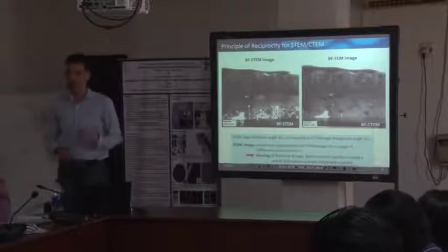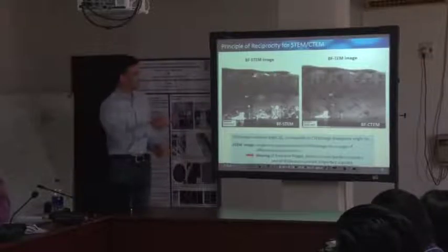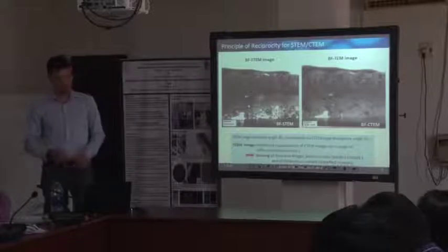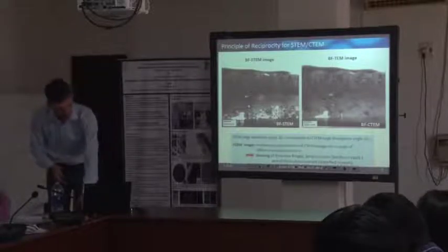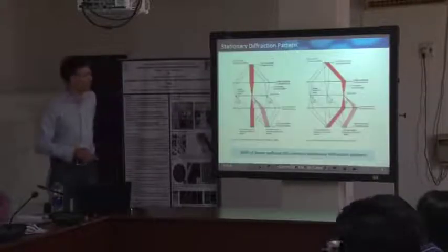So with bright field and dark field STEM detectors, we always end up with some pronounced diffraction contrast, and only with this HAADF detector do we have a pure, almost pure chemical contrast.